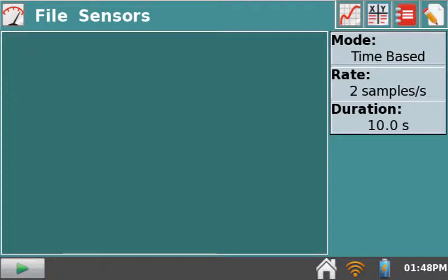In order to share LabQuest 2 data with your iPad, Chromebook, smartphone, or other mobile device, you must be sure data sharing has been enabled on the LabQuest.